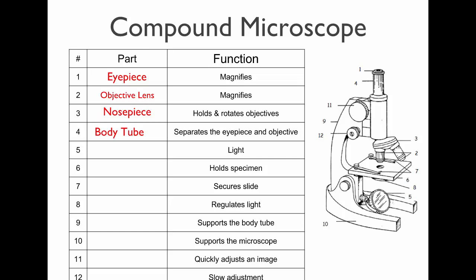There's different types of microscopes that you can get. Our microscopes are cordless. They have a little battery in here. And then they have a light down here, a light source. Some microscopes you have to keep plugged in, like those dissecting microscopes over there. We don't really have any of these. More modern microscopes have a built-in light. What does this have? No? That's a mirror. Older microscopes used to have a separate light that you would shine at it and then adjust the mirror to shine the light up. We don't really use those anymore. So we have a light there. That's our light source.